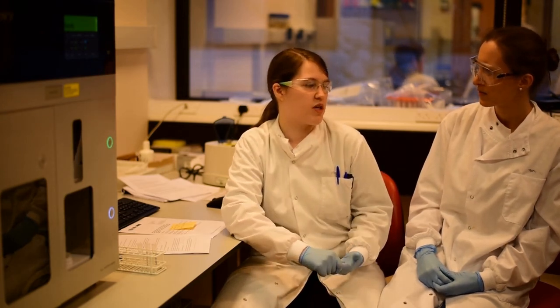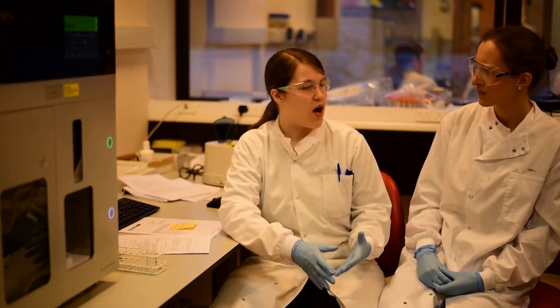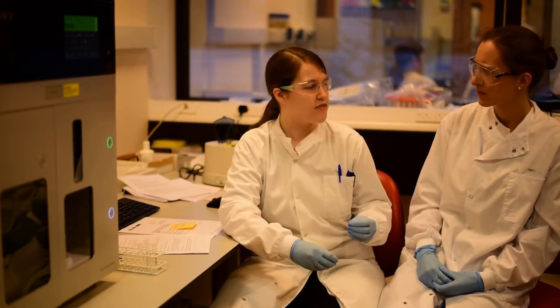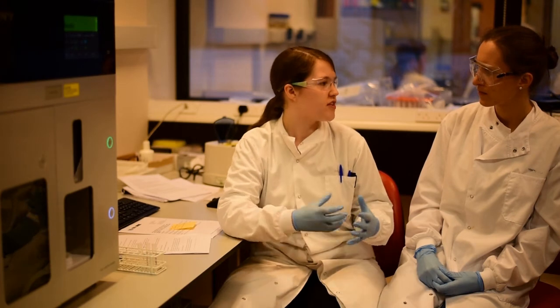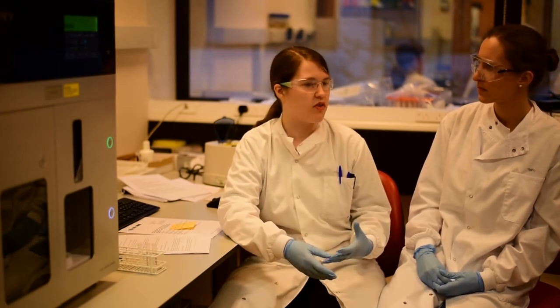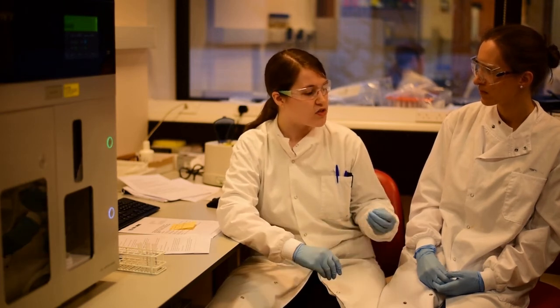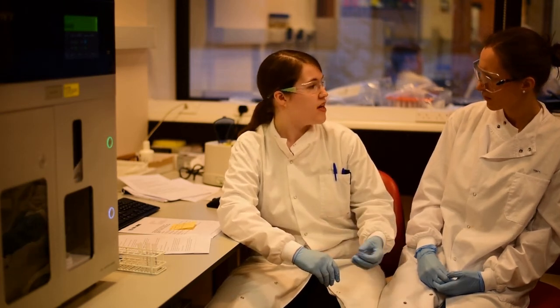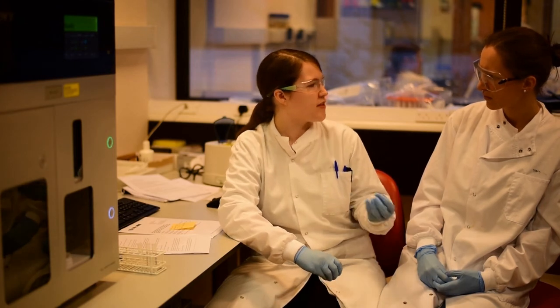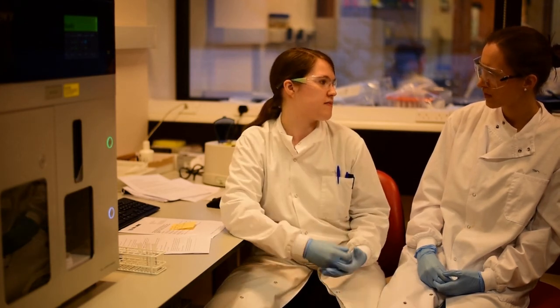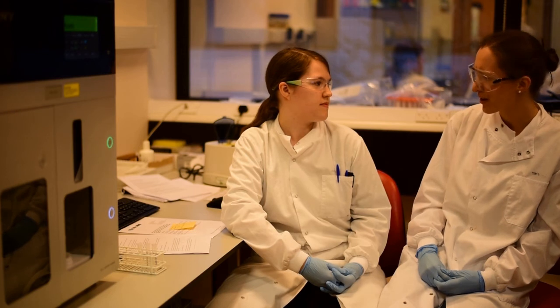Different scientists use flow cytometry for a number of different things, but mostly we want to look at how different types of cells respond to different conditions, like drug treatments or infections. Another really useful thing about flow cytometry is you can actually sort the cells by that color. So like in a bag of smarties, you've got different colors to pick out your favorite. Oh wow, so how does that work?